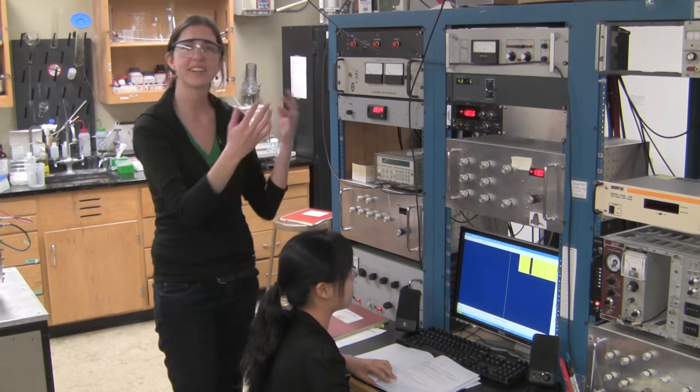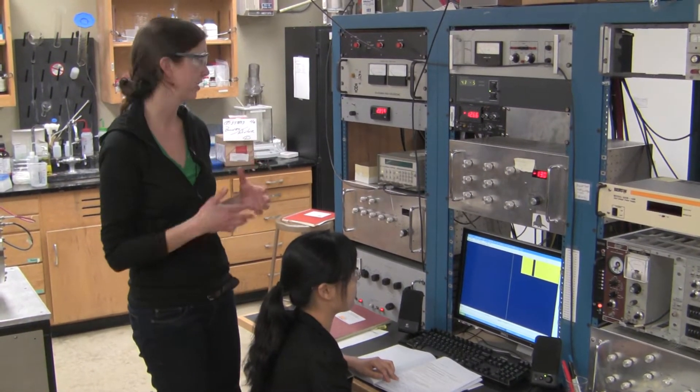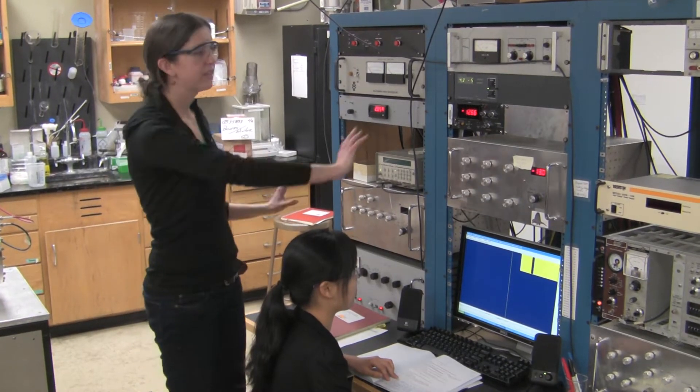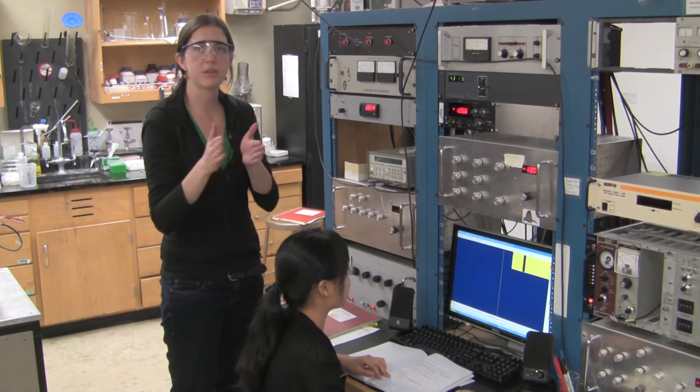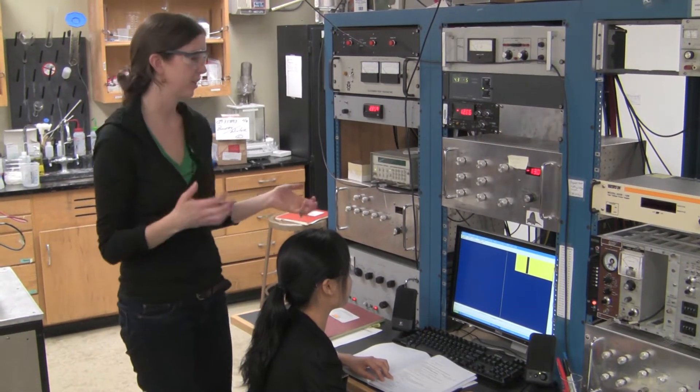So this is where we sit and collect our data during the experiment, during the ion mobility experiment. All of these knobs help us to control the ion optics on our instrument and focus the ion beam so we can improve our signal and get good data.